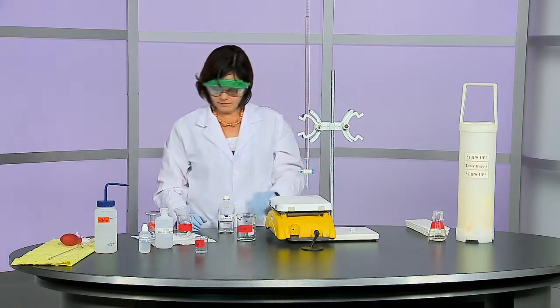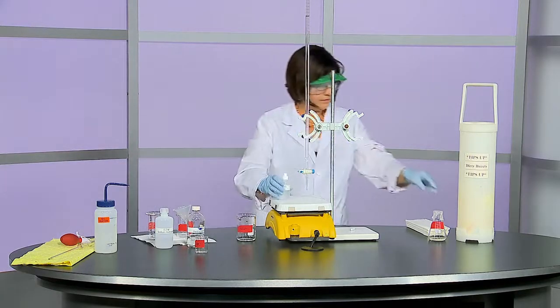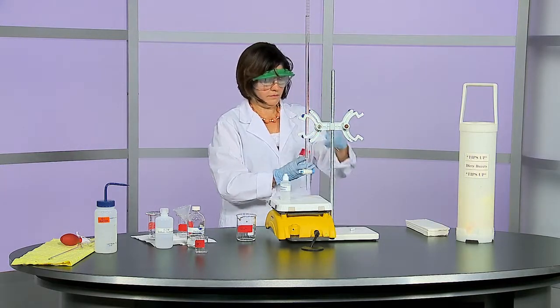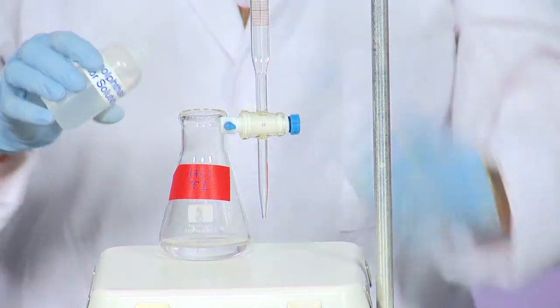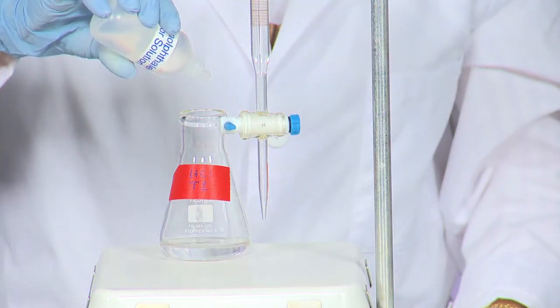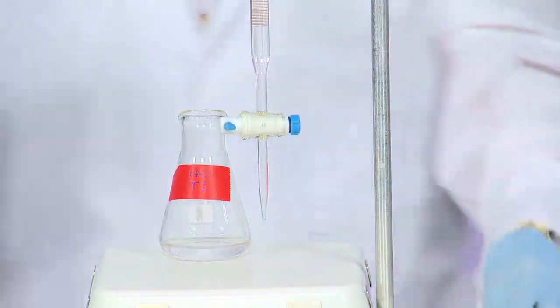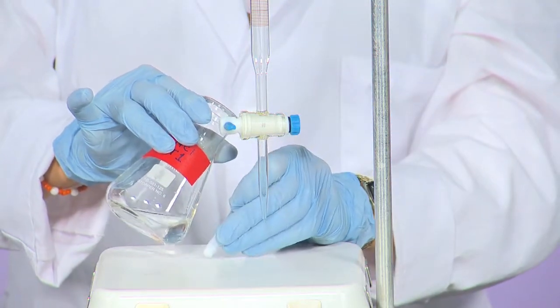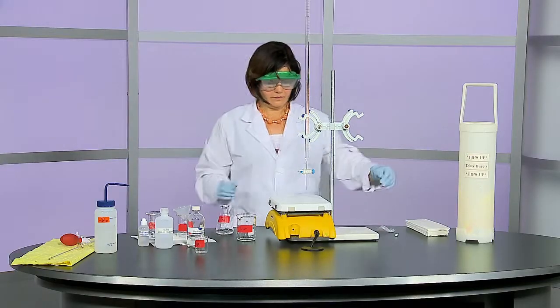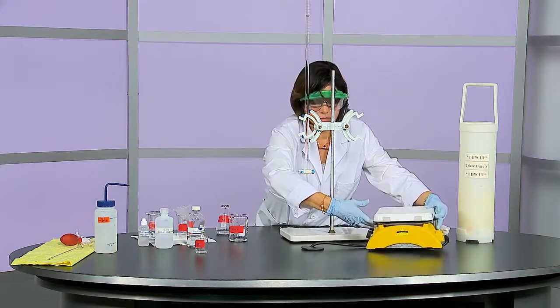Add 2 or 3 drops of the indicator into the measured analyte. If using the electric stirrer, hold the Erlenmeyer flask on an angle and slide the magnetic stir bar inside. Today we will demonstrate stirring by hand in case you do not have an electric stirrer.